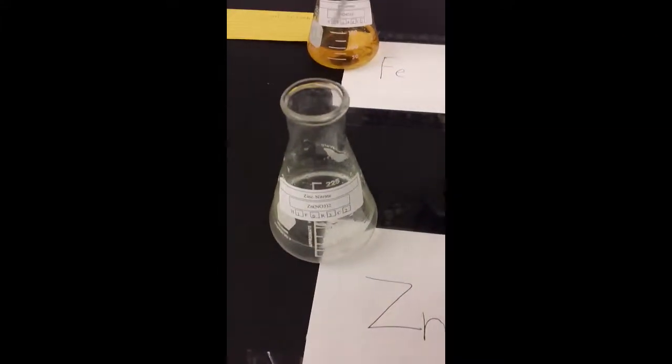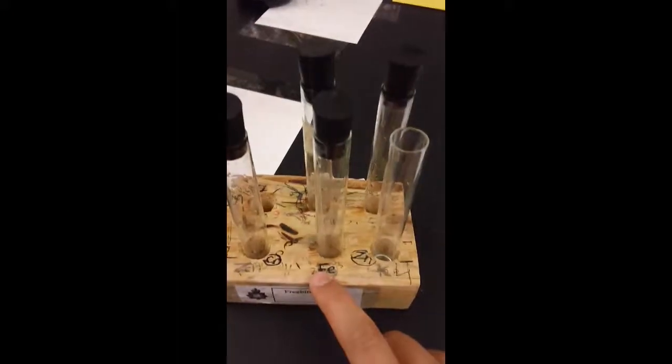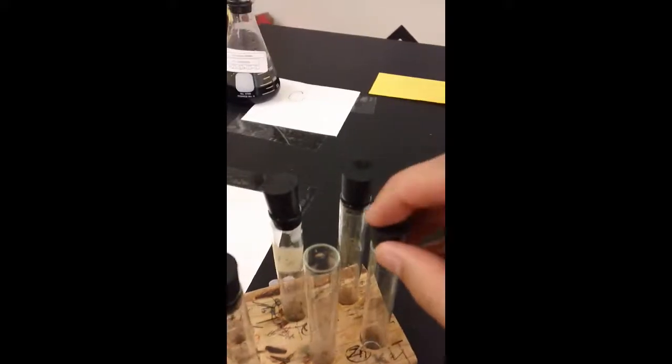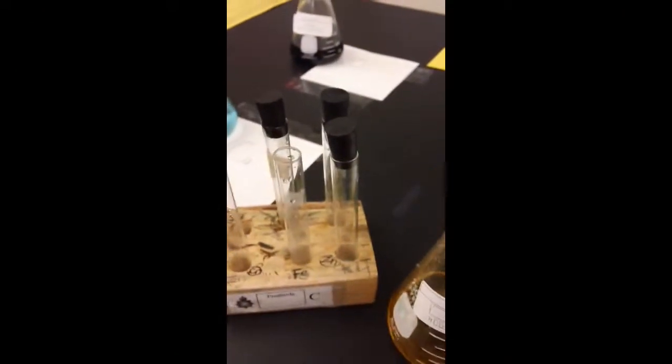Notice how this one down here says Zn, so I'm going to put 1 milliliter of the zinc nitrate in here. And 1 milliliter, as we know, is just to the top, or about the top of our pipette. So that goes in there. Next, we're going to put in our Fe into this test tube. We want to make sure we're not mixing pipettes, so this is my Fe. I'm going to bring it over here, put it into my labeled Fe test tube.